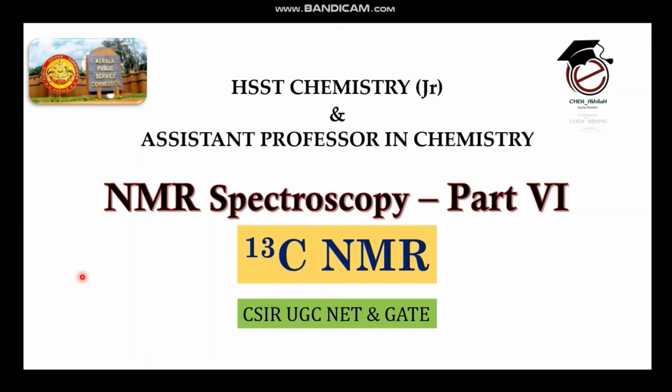If you did not watch the videos related to proton NMR, please watch those, because the fundamentals of NMR spectroscopy are already explained. If you have an idea about that, it's very easy to understand C13, because in proton NMR we have discussed almost all things. The theory part is almost the same for proton NMR, C13 NMR, F19, P31, whatever active nuclei or NMR is available. So first you build an idea about proton NMR, then you come to C13 NMR or any other heteronuclear NMR.